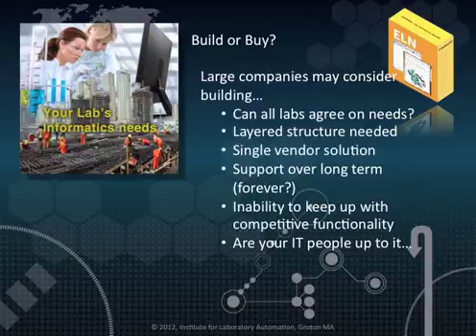While those words are easy to write down, making them happen is a big job. If your information technology support groups don't have a good track record on smaller projects, they'll never tackle this one. By building your own in-house systems, you have a single vendor solution that is limited by the underlying platforms of both operating system and hardware. Do you want to deal with single vendor solutions? Do you have the ability to support these products over the long term?